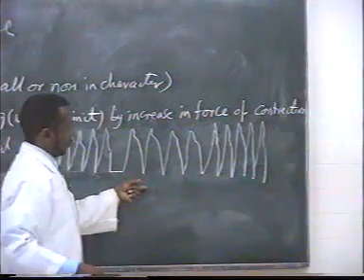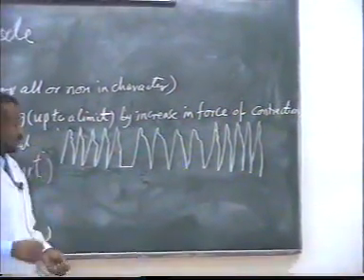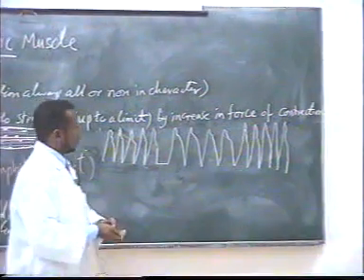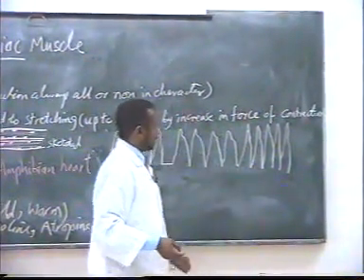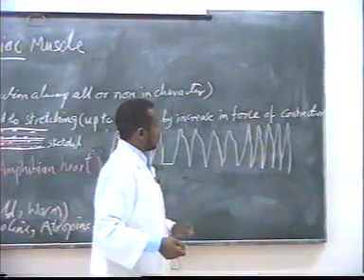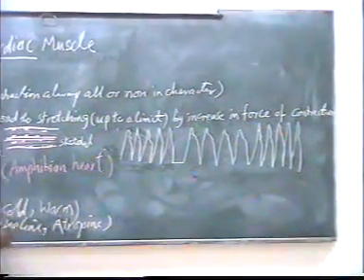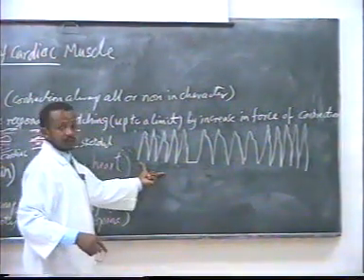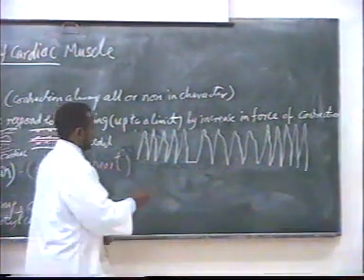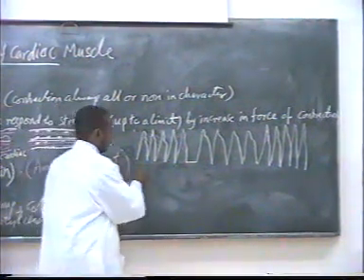When we add cold ringer at low temperature, the heart rate decreases, and when the temperature increases, the heart rate and the force of contraction also increase. Usually, we can calculate the heartbeats by referring to the speed of the recorder.